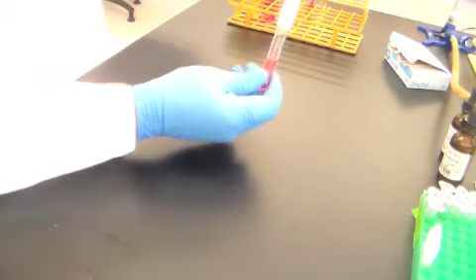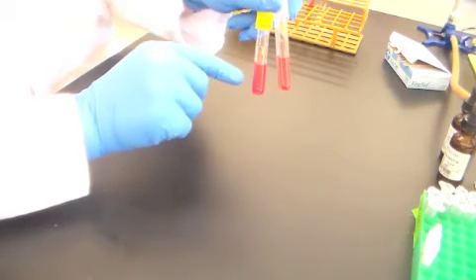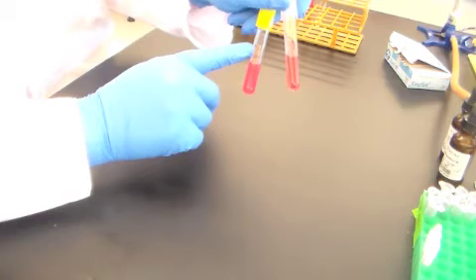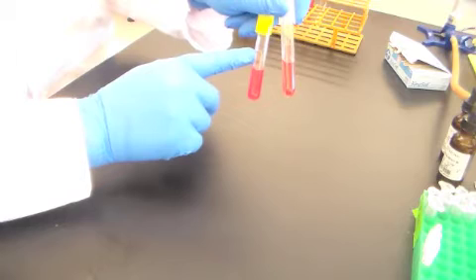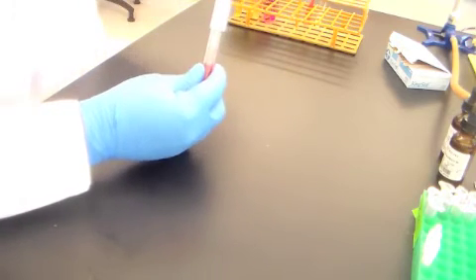In a negative reaction, you can tell that the bacteria actually grew because of the turbidity in this tube on the left. Remember, the tube on the right is uninoculated. Because it hasn't changed the pH to an acid condition, the bacteria did not create acidic fermentation products. So this bacterium would be negative for the ability to ferment lactose. There is a little bit of a pH change in the media inside the Durham fermentation vial. If you see something like that, but the rest of the media remains neutral or alkaline, that's a negative. You consider that a negative reaction.